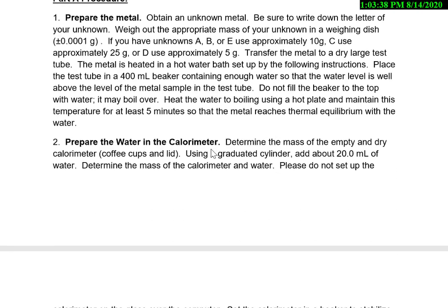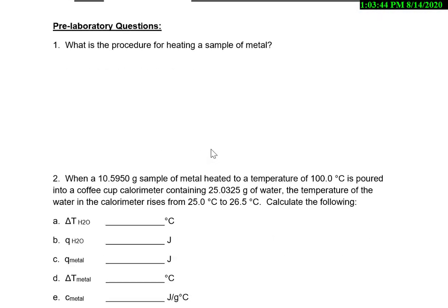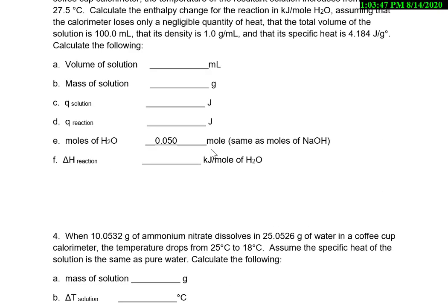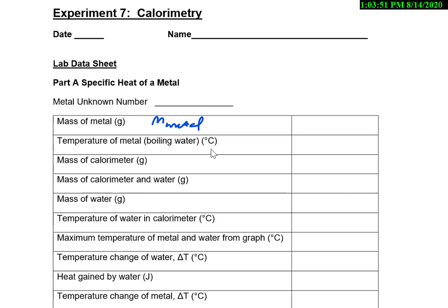The videos will show you the procedures and talk through those. What I'm going to do is focus on the calculations for you for a minute. So you'll do all of the pre-labs, and then in experiment 7, data sheet.